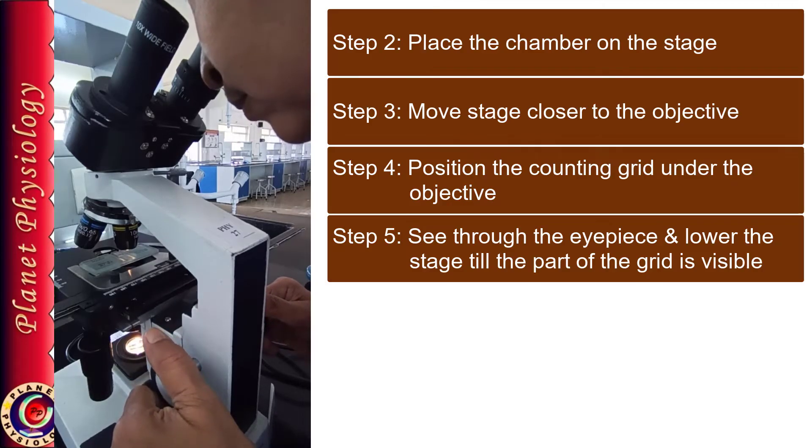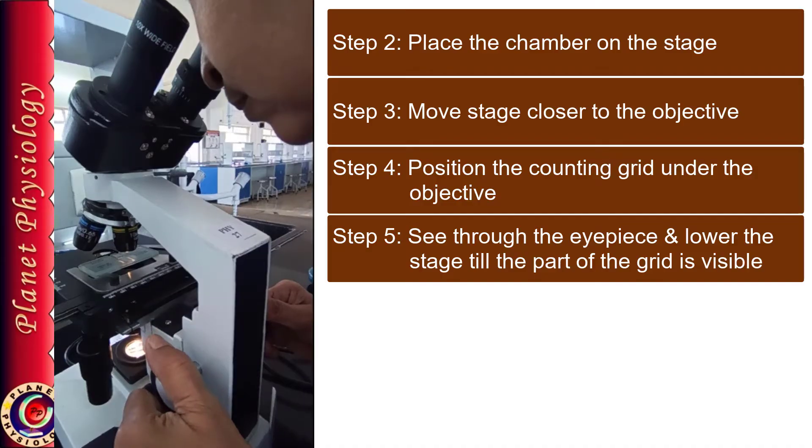I am using self illuminating microscope, so I am moving stage down. So I am repeating. See through the eyepiece and increase the distance between the objective and the chamber till you see some part of the grid.